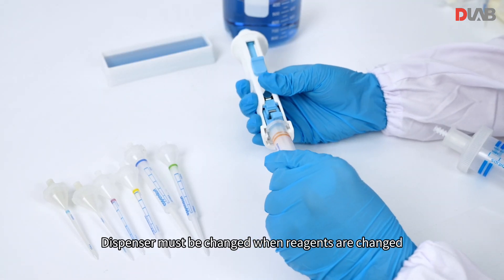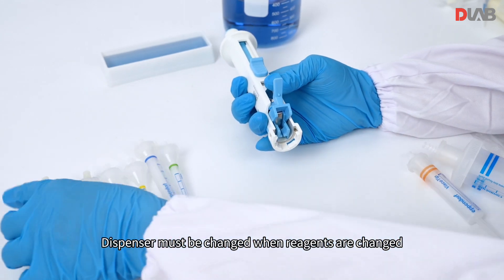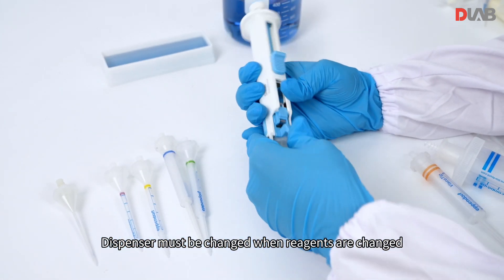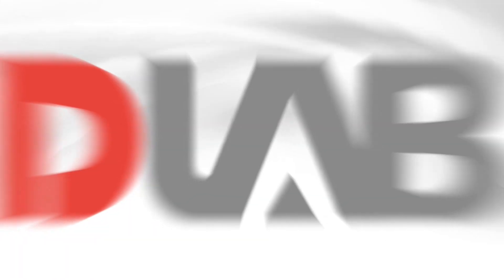The dispenser must be changed when reagents are changed.